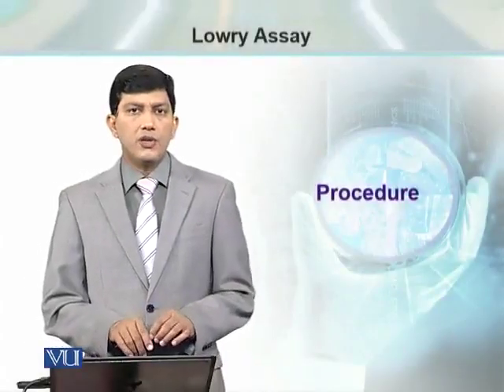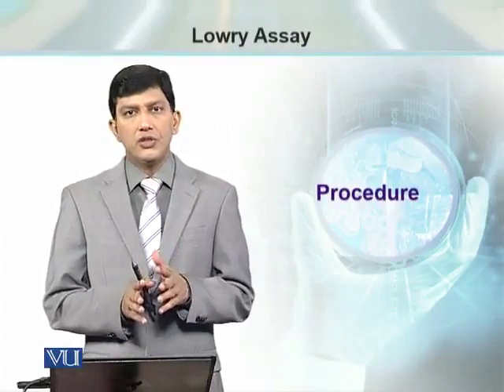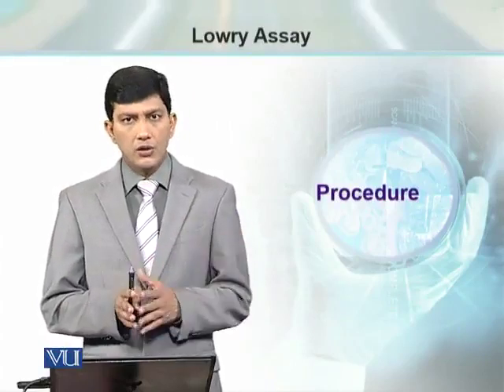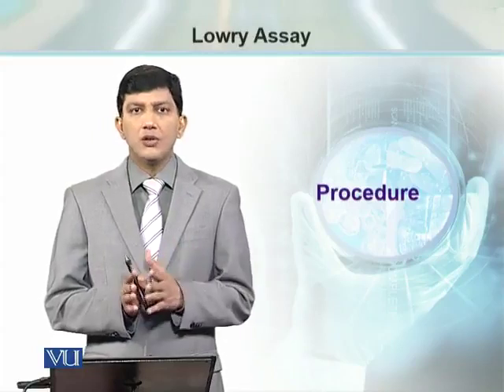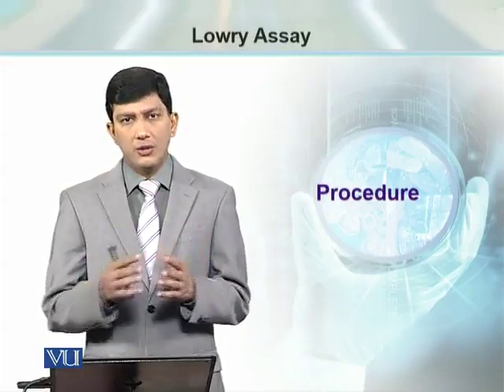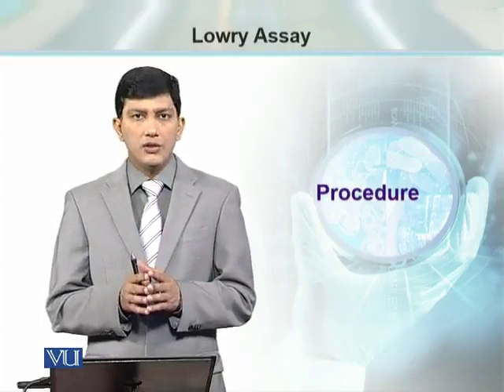लोरीज ऐसे के प्रोसीजर के हवाले से जब हम बात करेंगे, more or less its procedure is similar to the बायोरेट ऐसे, लेकिन इसमें थोड़ा सा टाइम हमें ज़्यादा चाहिए होता है बिकॉज हमने इसमें एक एडिशनल स्टेप परफॉर्म करना है, that involves the reduction of Folin's reagent.